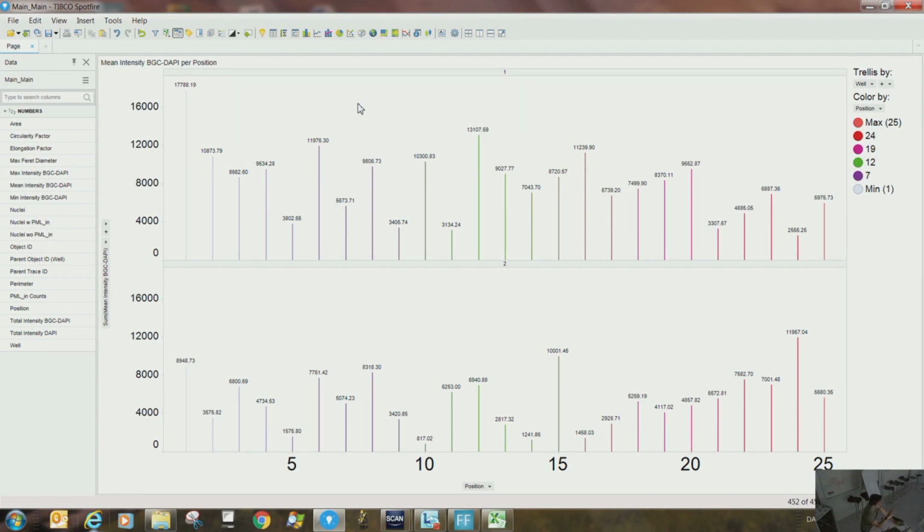Stratified by different wells, you see basically what's happening in one particular position or one well. These are the numbers. So I can clearly see, if this had been a replicate, that something has gone wrong. For example, this one. You see here, at this position, this is small and this is high. So if this had been a replicate, there is something wrong at that particular position.